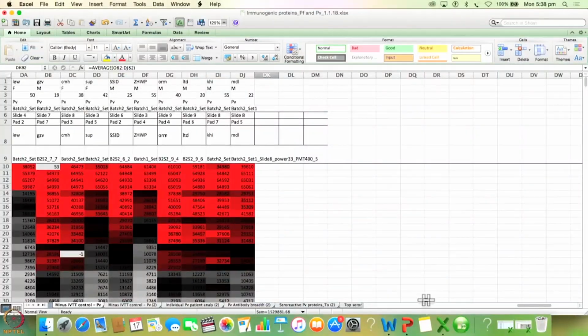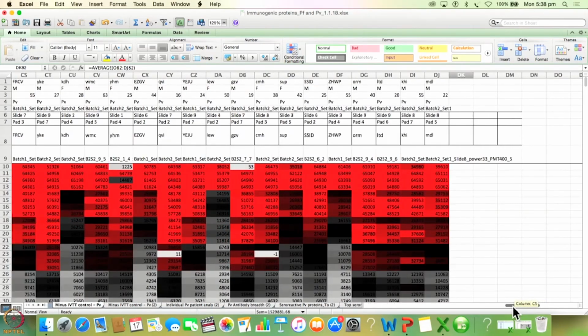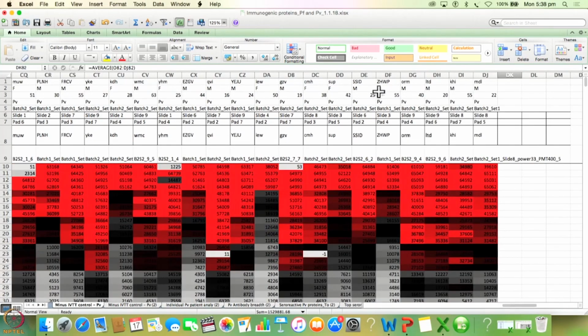What I missed telling you before is that the previous sheet had many more columns here. That's because we had a lot more samples which were probed on the chips. For example, we had positive controls, which are nothing but samples taken from a highly malaria endemic region. So you know that those spots have to give you a signal, right. So those are my positive control samples.